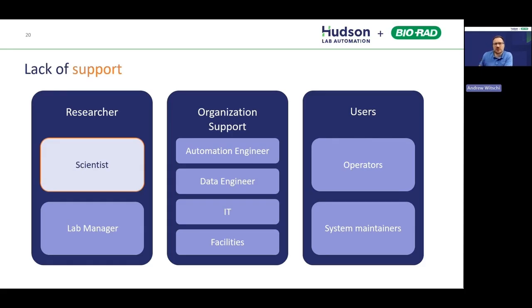And that's not just in the post-installation phase when you're deployed. This is critical in the design phase when you're saying, what automation is appropriate for us? These are all stakeholders that need to be involved in the architecting of that automation solution. Even if you're looking at workflow automation, as soon as you start talking about data that has to move between labs, all of these stakeholders in your organization have to be involved in the beginning.